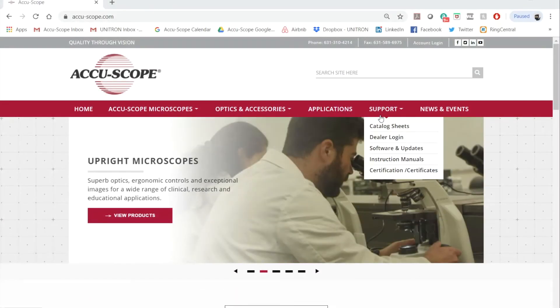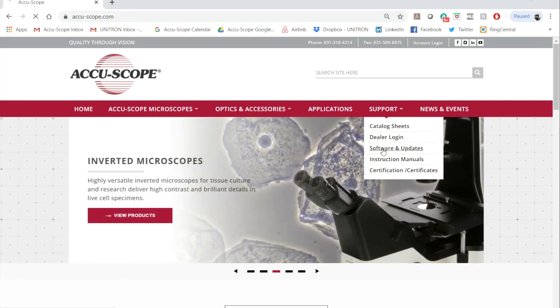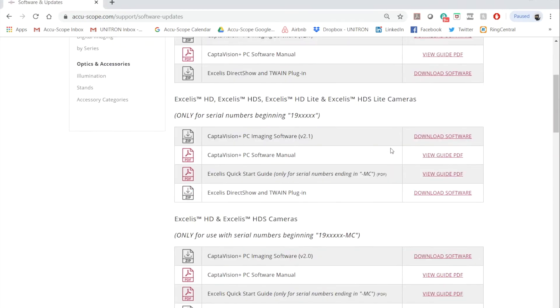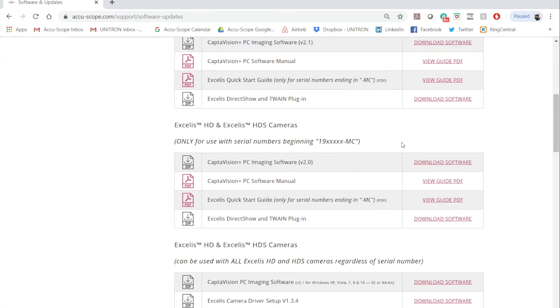Go to Support, then Software and Updates. Scroll down to AccuSlide MS.